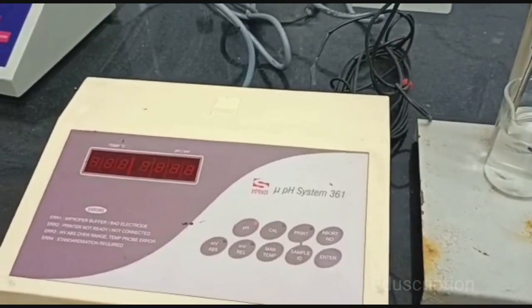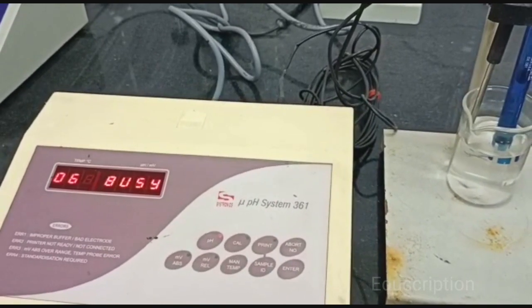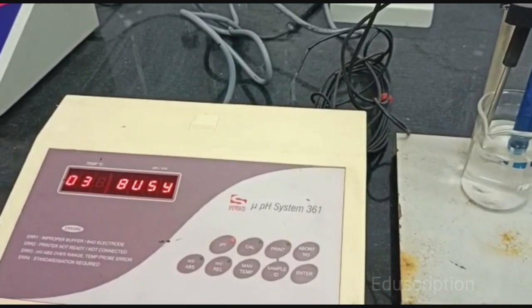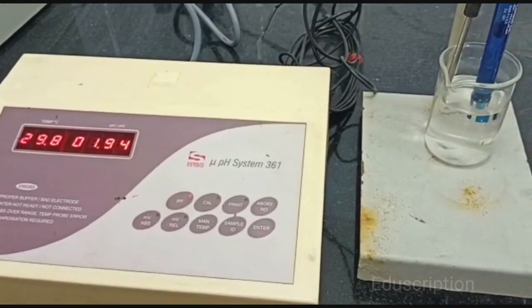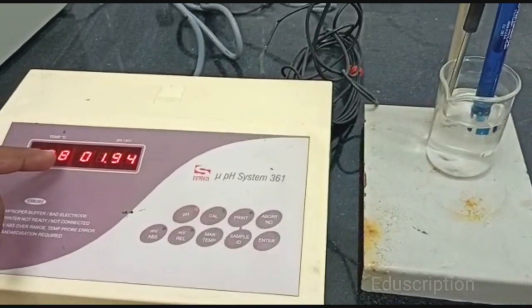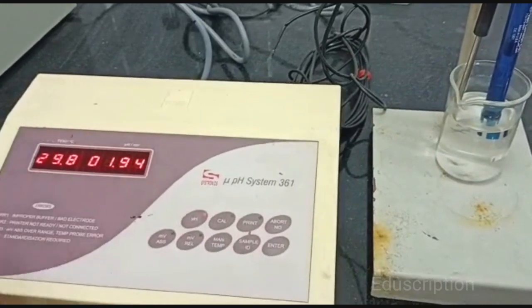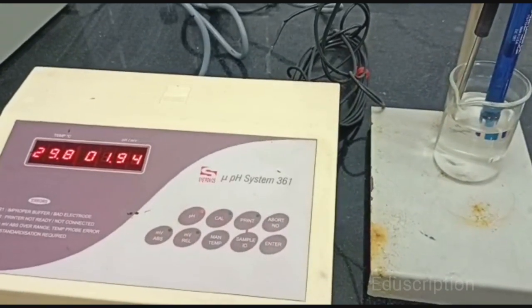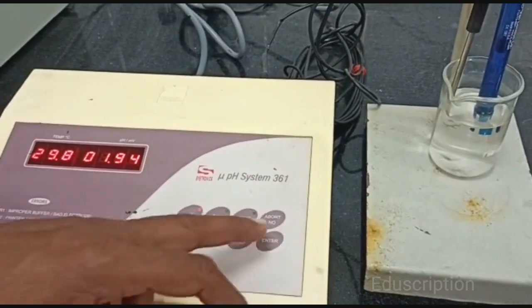Now just enter it and observe what is the pH value of beaker 1. See, 29.8, that is your temperature. 1.94 is the pH value of this beaker solution.